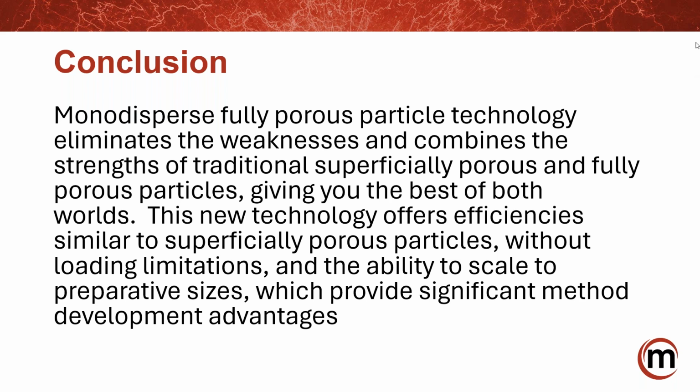So, first question, Geoff, how easy is it for me to translate an older method to a monodisperse particle method?